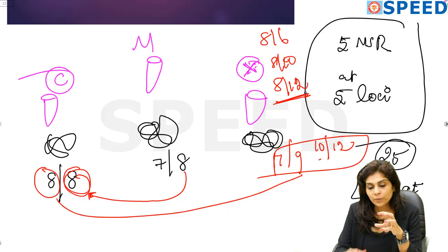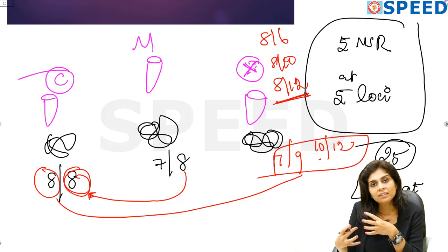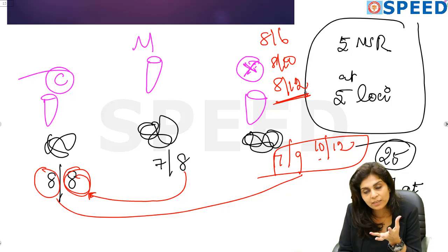When you look at 25 sites, you will have a clear-cut conclusion. This is only by looking at one site. But what we do is look at at least 25 sites. So by the end, we'll have a concluding evidence.